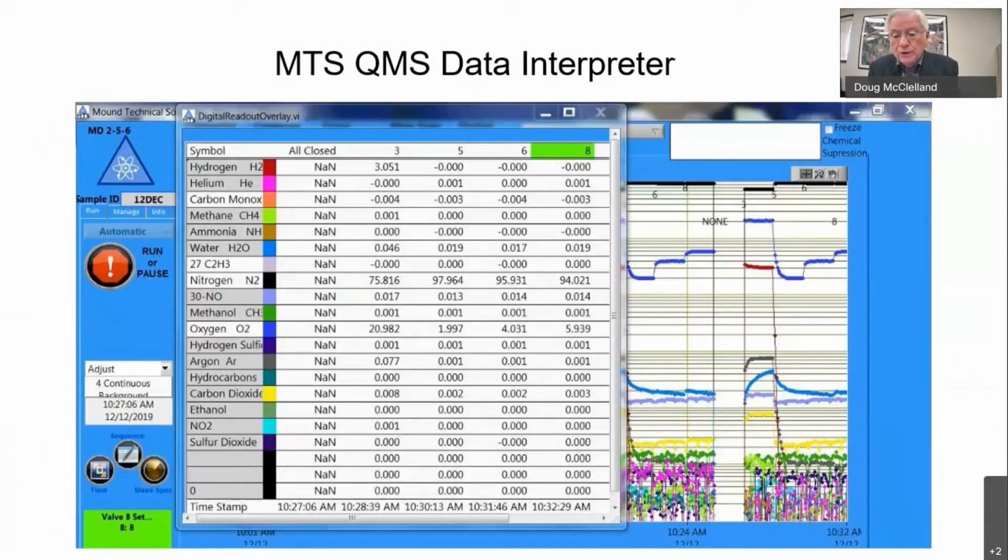If you look over to the right, there is the black nitrogen, blue oxygen, red 3% of hydrogen, and then argon and other things you might expect to be in air. And then there are the small 2%, 4%, 6% oxygen in nitrogen standards. And those then are shown here.